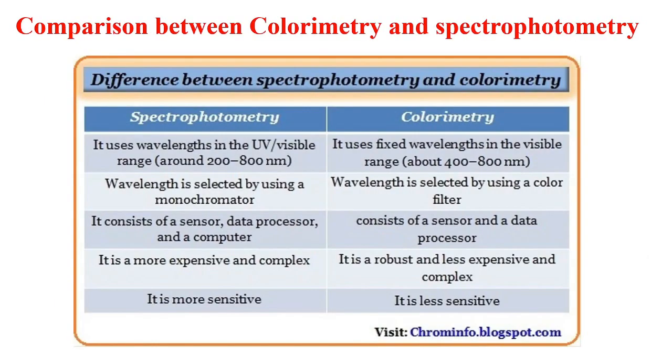Whereas if you want to see through the glass and see what is on the other side, that is transmission. Light is transmitted through the glass and I am able to see it. So in transmission spectroscopy, you have the light source and the detector on either side of the sample, and in reflective spectrometry or colorimetry, they are on the same side of the sample.